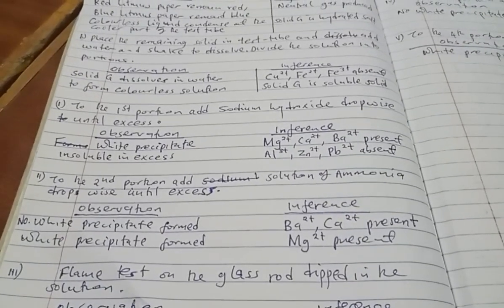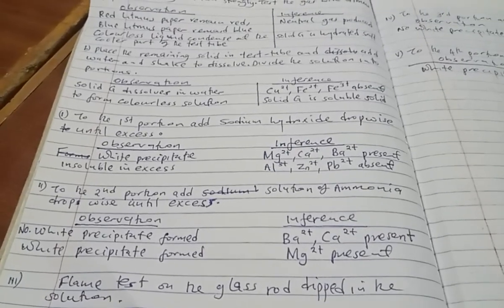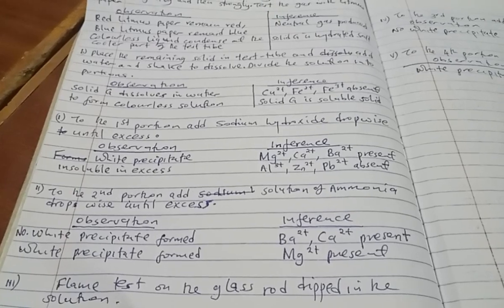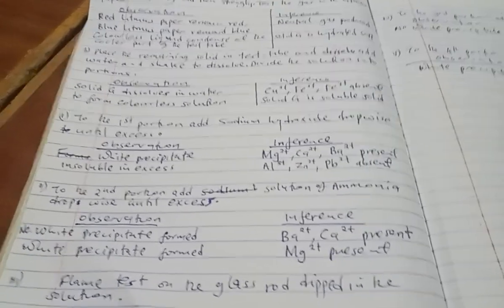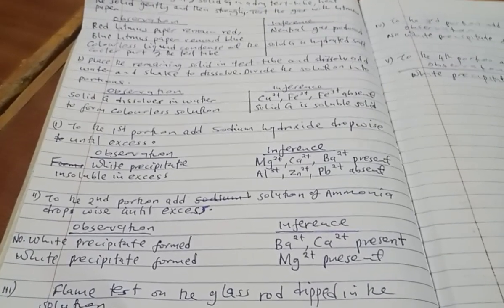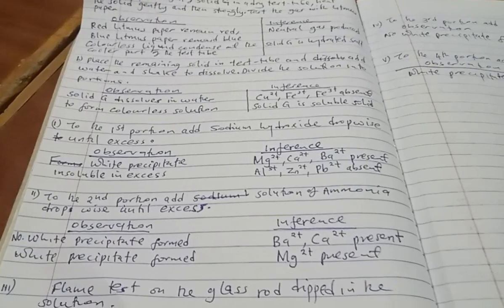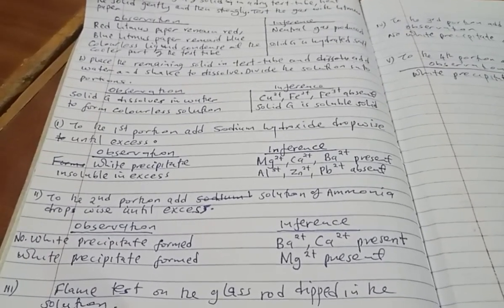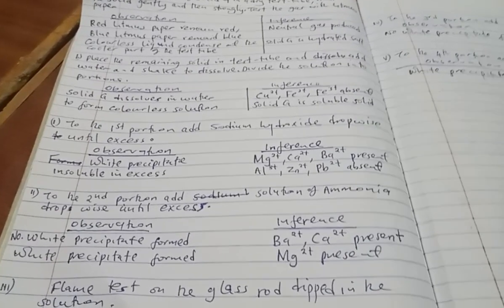Though barium is normally bringing issues because the reaction is not normally very visible. So it depends on the saturation of the solution. So it is magnesium, calcium, and barium present if it is insoluble in excess. And that one will also mean that aluminium, zinc, and lead ions are absent.